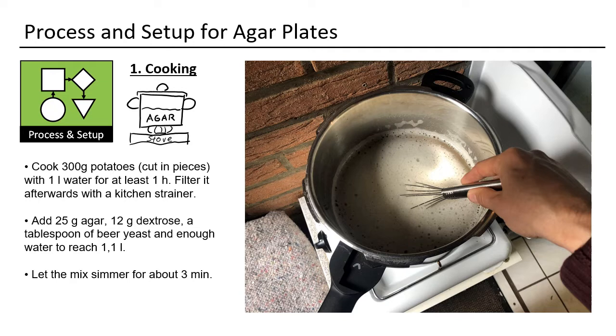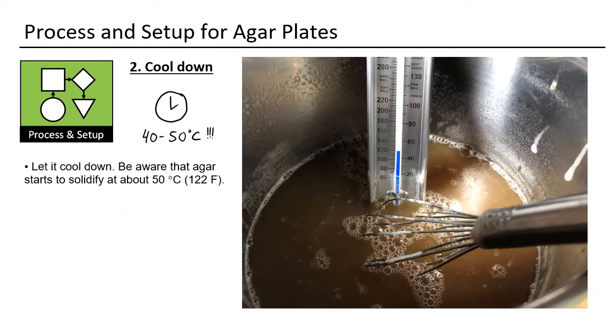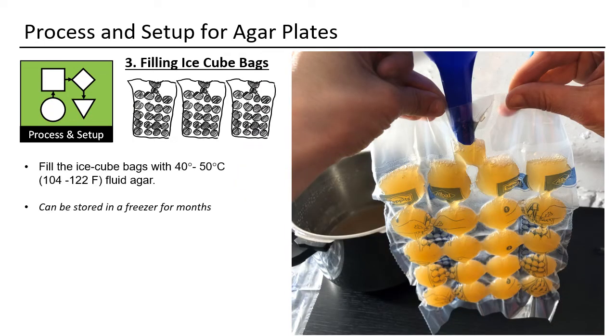Let it simmer for 3 minutes. Be careful that it does not overboil. Finally you let it cool down. It should not go below 40 to 50 degrees Celsius. At that temperature the agar will solidify. While it is still fluid, you pour it into ice cube bags.